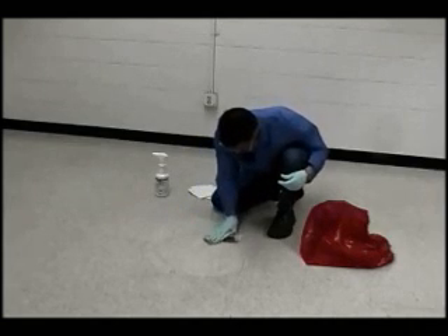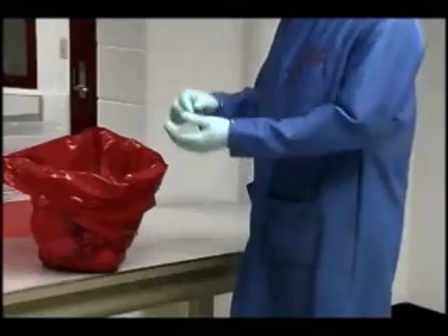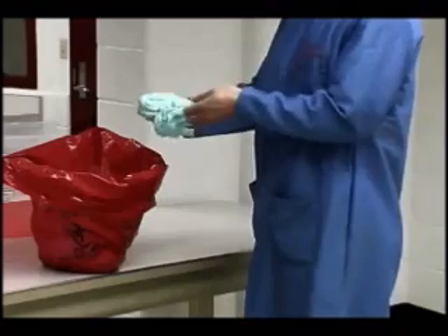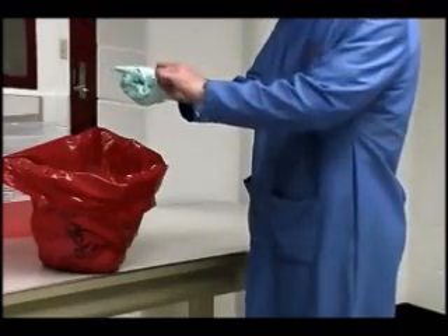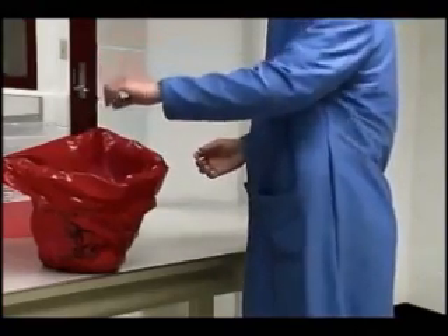Place all contaminated disposable material in an appropriate disposal bag and place in proper hazardous waste disposal areas. Remove all personal protective equipment and dispose of properly. Then wash hands immediately with soap and running water for 30 seconds.